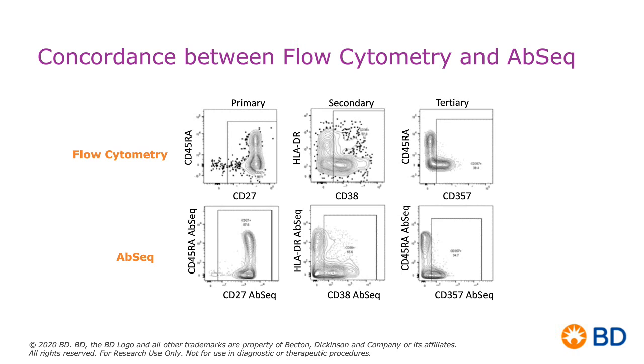Now, I can tell you we didn't intentionally design this panel so that it would have that spread. This is actually a pretty good panel. I'm pretty happy with this resolution. But what really draws my eye about the AbSeq technology is that 0 is 0. If there are no counts, it is 0.